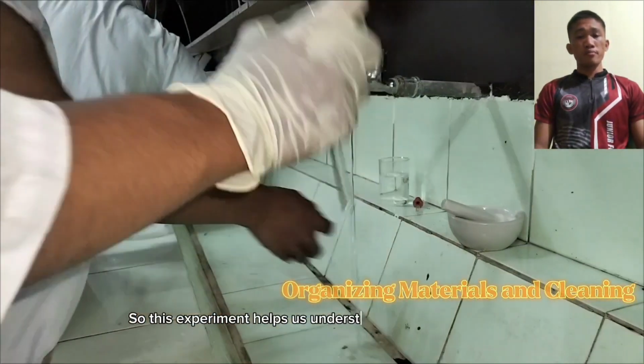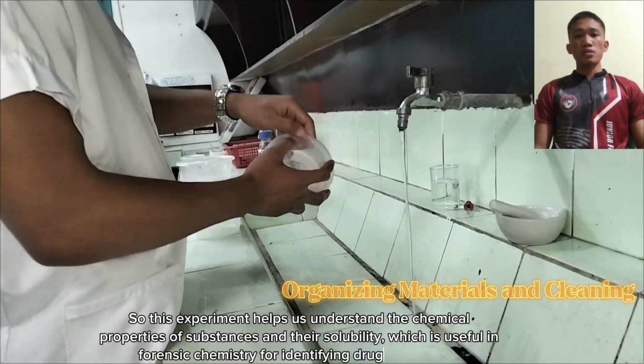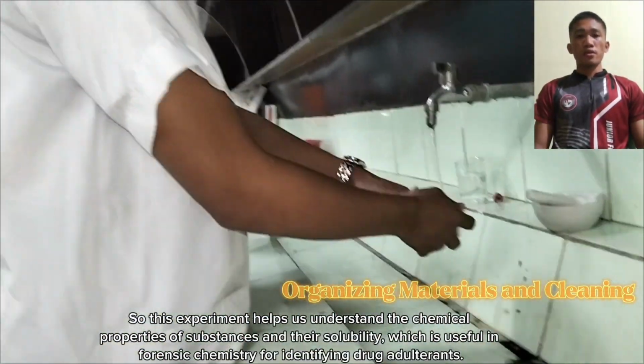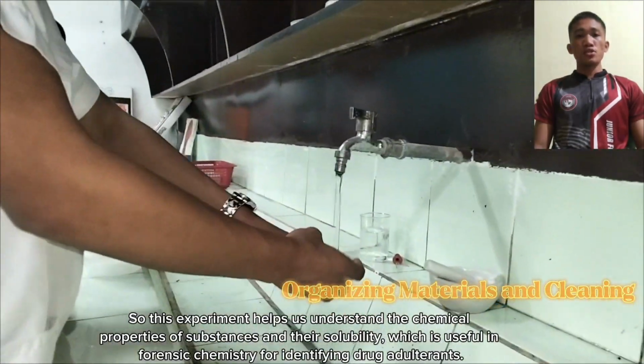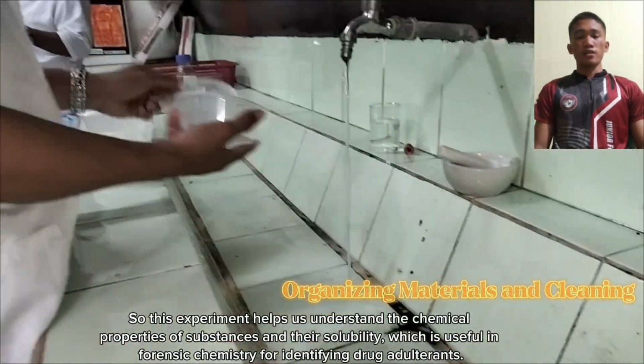So this experiment helps us to understand the chemical properties of substances and their solubility, which is useful in forensic chemistry for identifying drug adulterants.